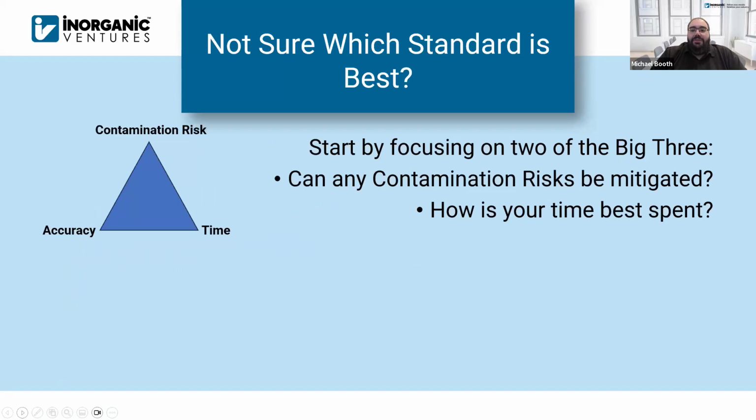Is there anything you can do to decrease the risk of contamination if you're worried about it? And then when you think about the time savings, or the time part of selecting the best standard, I always like to tell people, what is the best use of your time? Typically, when folks get in the lab, it's really good for them to get experience in making standards. But if you've been making the same set of standards for years on end, there's typically better uses for your time than that, and it allows you to get more done throughout the day.